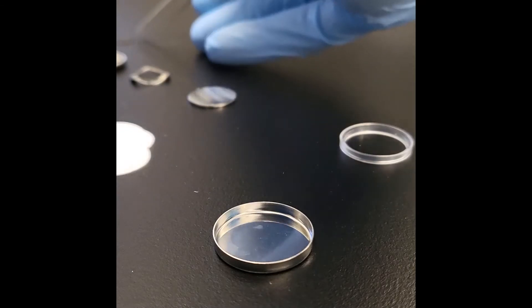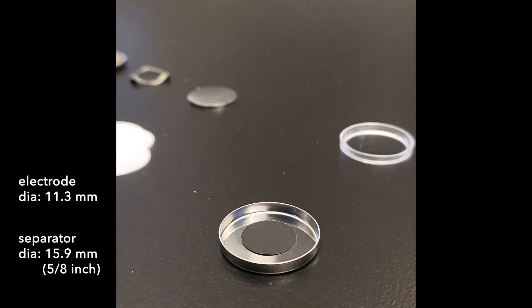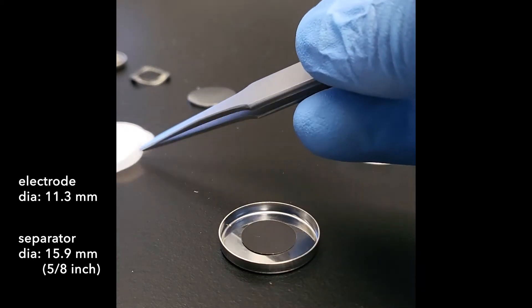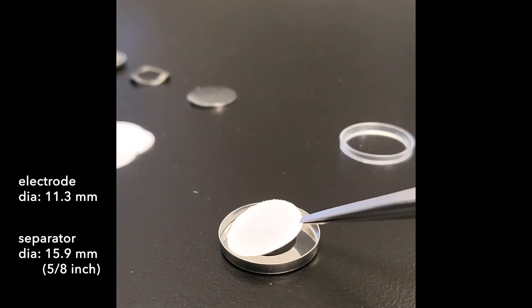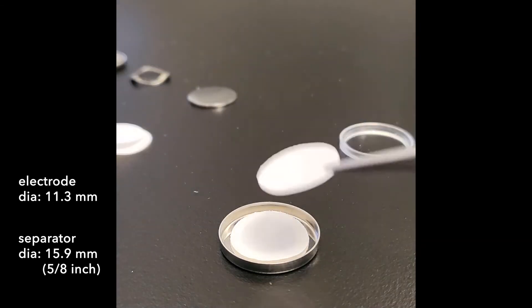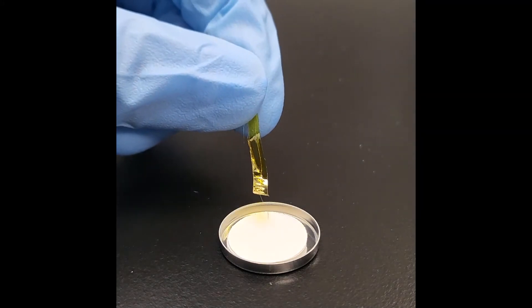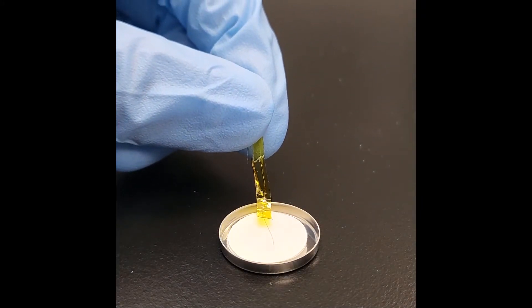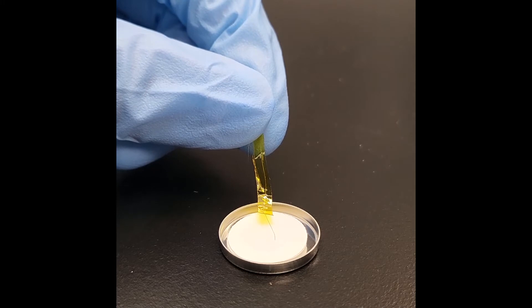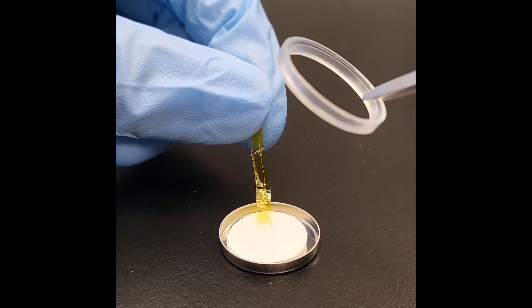Now we're ready to start the assembly. Place the positive electrode, and then the separator. In this demo we're doubling the separator, but feel free to adjust the separator thickness in a way that works best for you. Now it's time to place the stainless steel wire. We want the wire to be centered. At the same time, the exposed wire should sit inside the separator area with a comfortable margin.